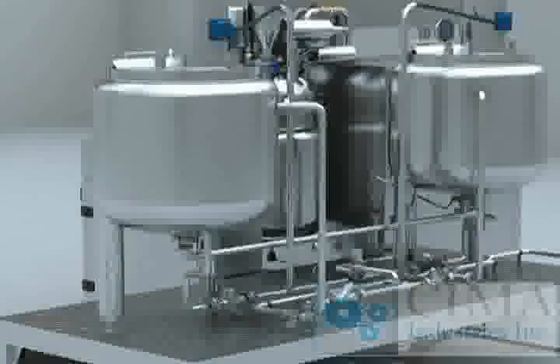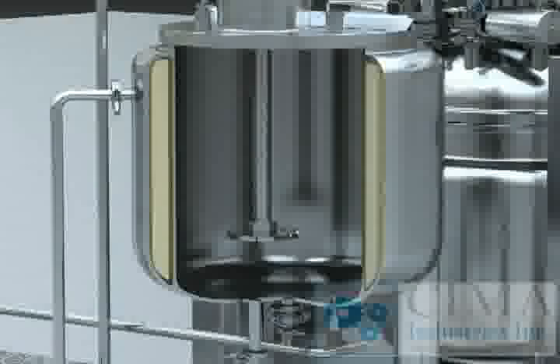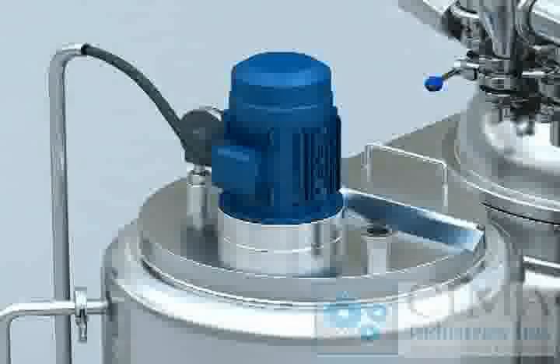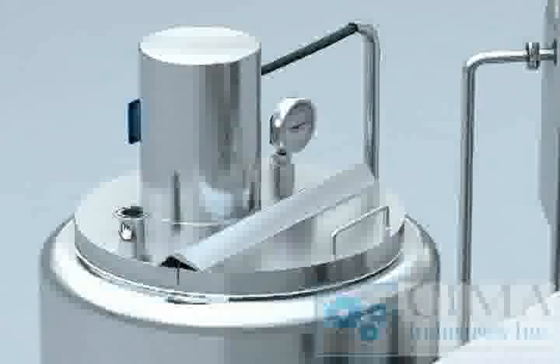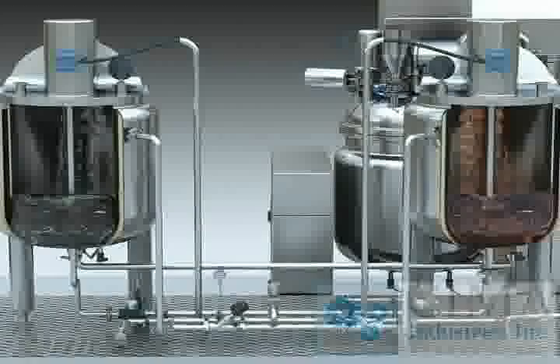The blending system is made up of a working platform, oil tank, and water tank. The oil and water tanks have a three-layer structure with an upper half-open lid and a lower ceiling head. The lower ceiling head is connected with the tank by flange, and the thermal protective layer adopts PU foam technique. Other components include a wave wheel mixing device inside the tank, discharge valve and temperature sensor at the bottom, half-open lid, mixing motor, and inlet and round thermometer at the top. After opening the half-open lid, material is loaded into the oil and water tanks and then mixed.